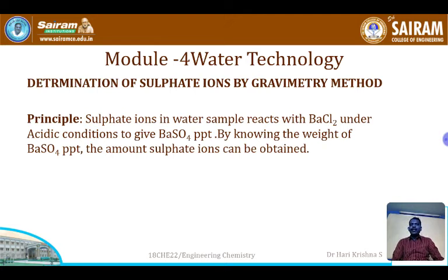So how to determine the presence of fluoride or sulphate in the water? Let us see determination of fluoride or sulphate in the water sample. Starting with sulphate, sulphate can be determined by gravimetric method.